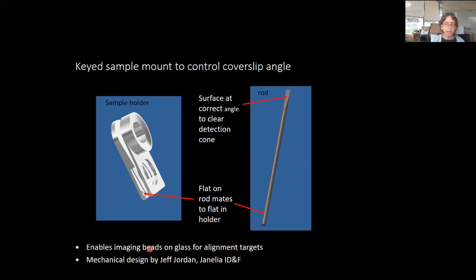And this is great because it lets you image all the way down to the glass. And that's particularly important because that lets you image beads on glass as your alignment sample. And frankly, you have to align the system every day. And so having an easy alignment sample is super important to making it practical.